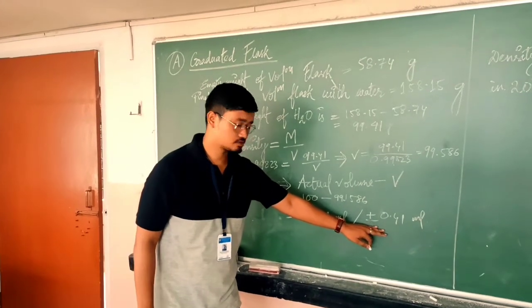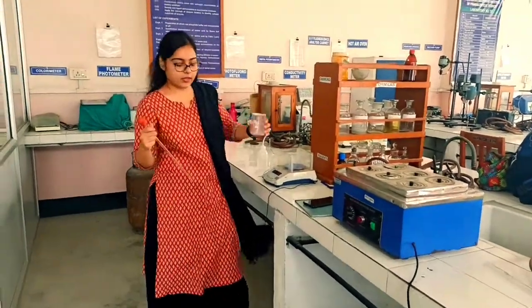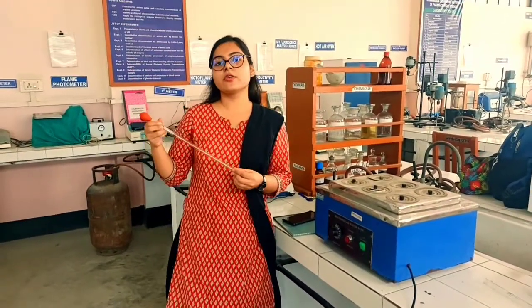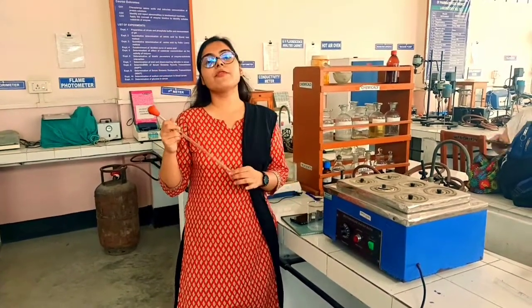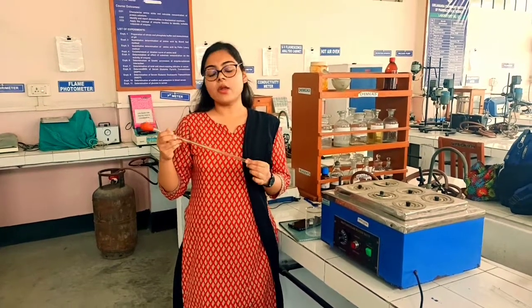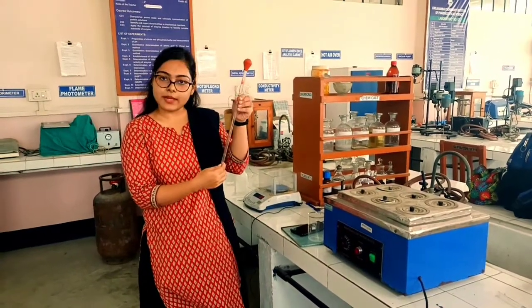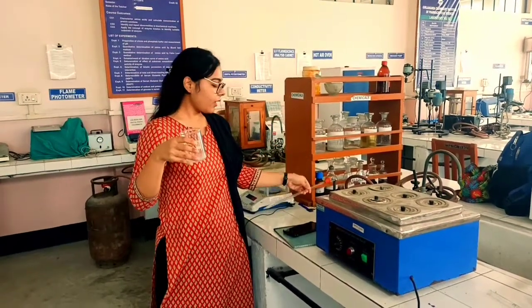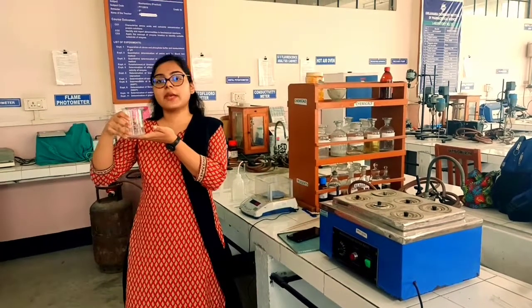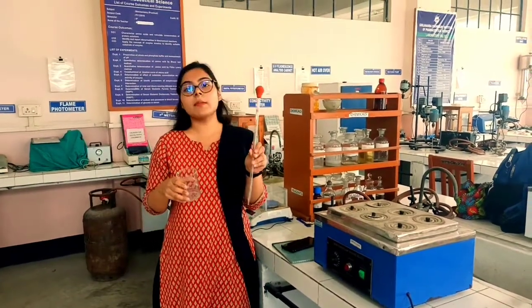Therefore, the volumetric flask that we are using has an error of plus or minus 0.41 ml. Next we will use this pipette in order to do the calibration. We don't have any method to directly weigh the amount of water which this pipette can hold. So what we will do is take water in this pipette and transfer the content from this pipette to this beaker. Then we will take the weight of this beaker. By this weight we can find what is the error in this 10 ml pipette.